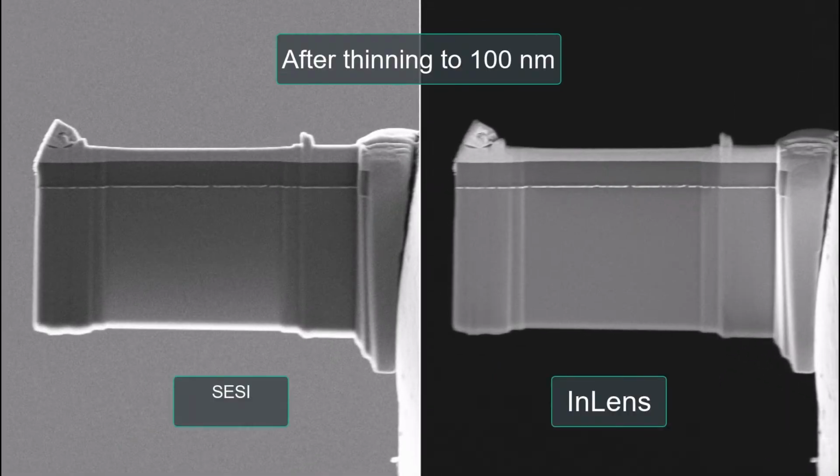At this point, since it's silicon, I didn't want to proceed with using 30 kV, so we're going to switch the FIB beam to 10 kV to get rid of some of the amorphous material that the 30 kV FIB beam caused. That'll produce basically a 10 nanometer amorphous layer on each side, which leaves plenty of the crystalline material.